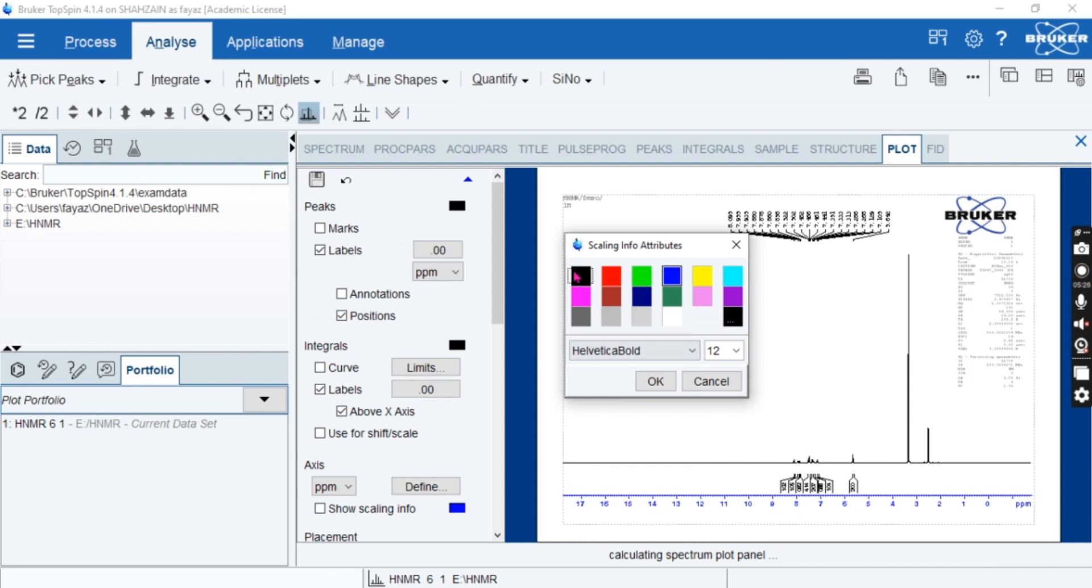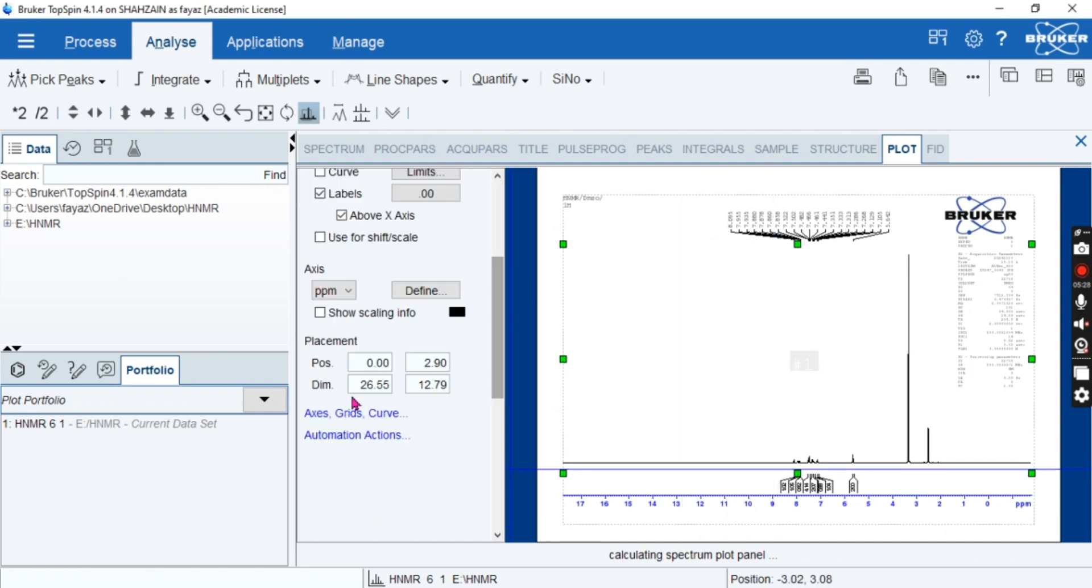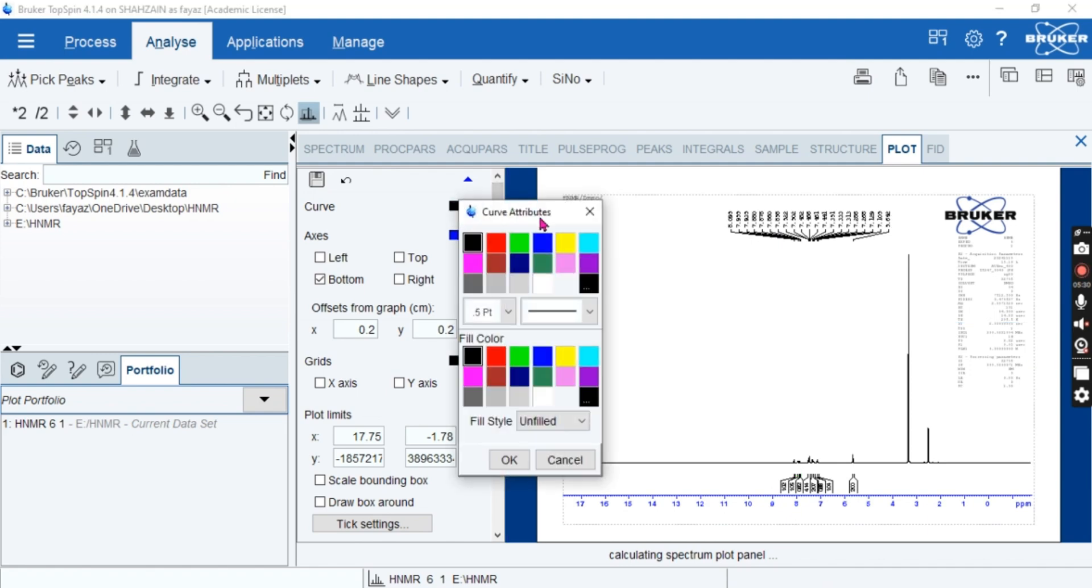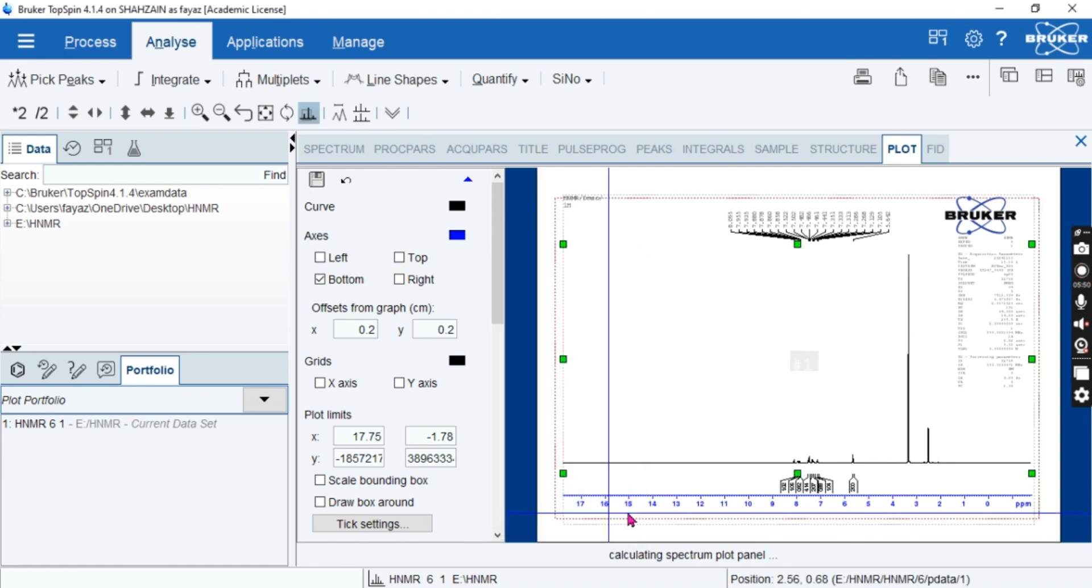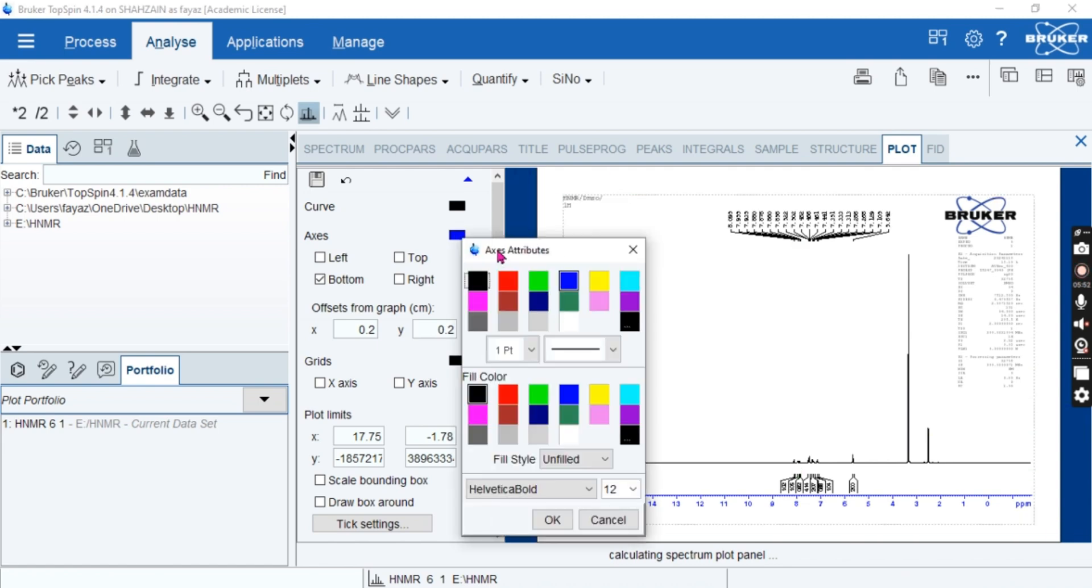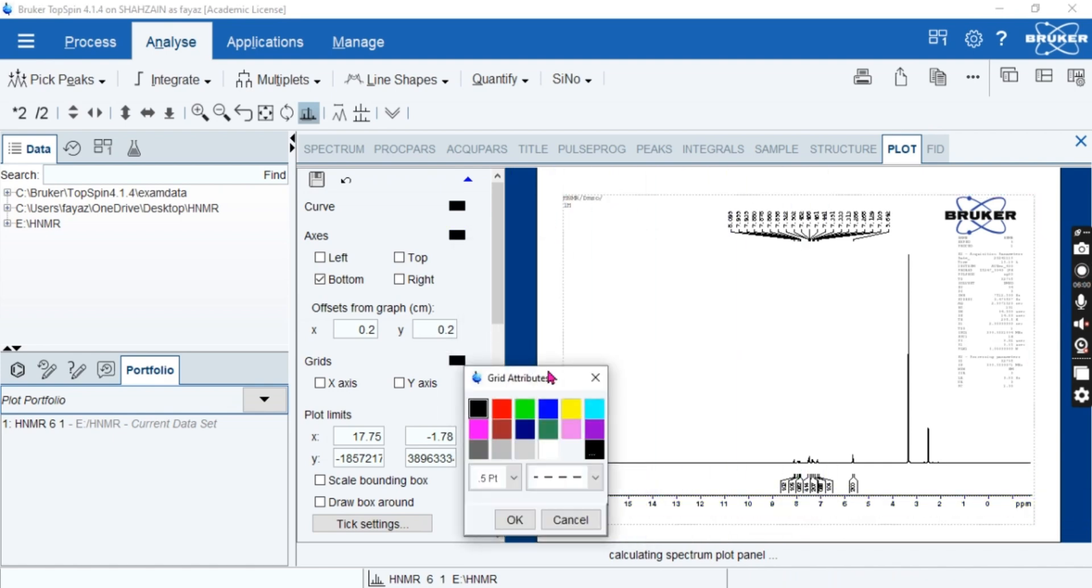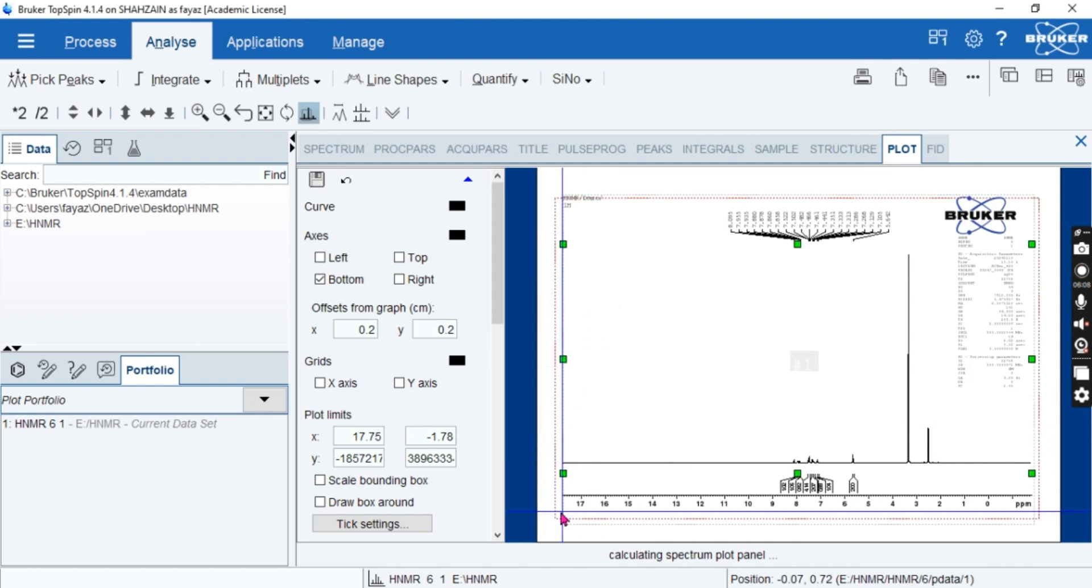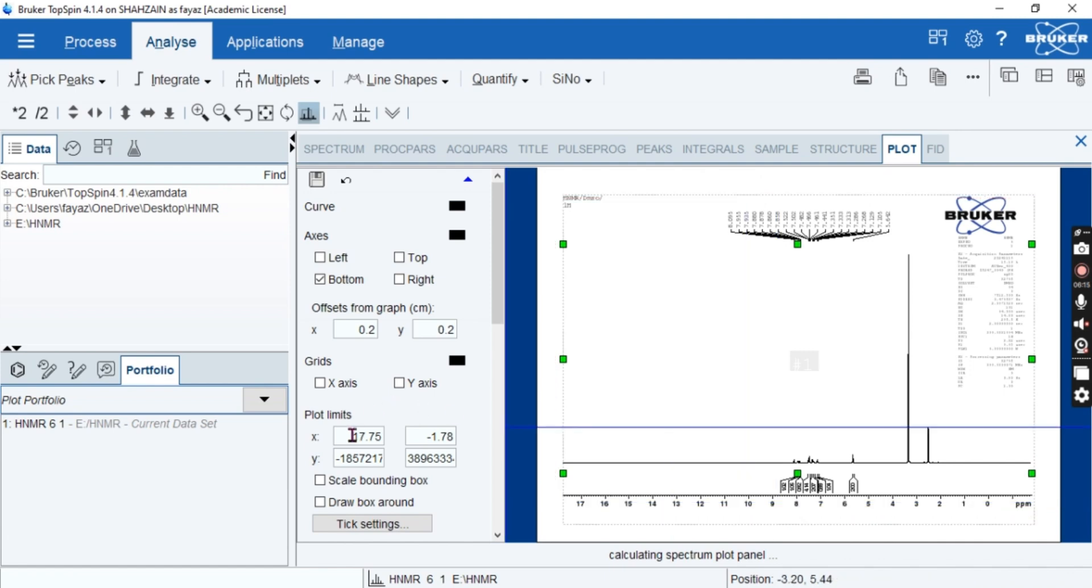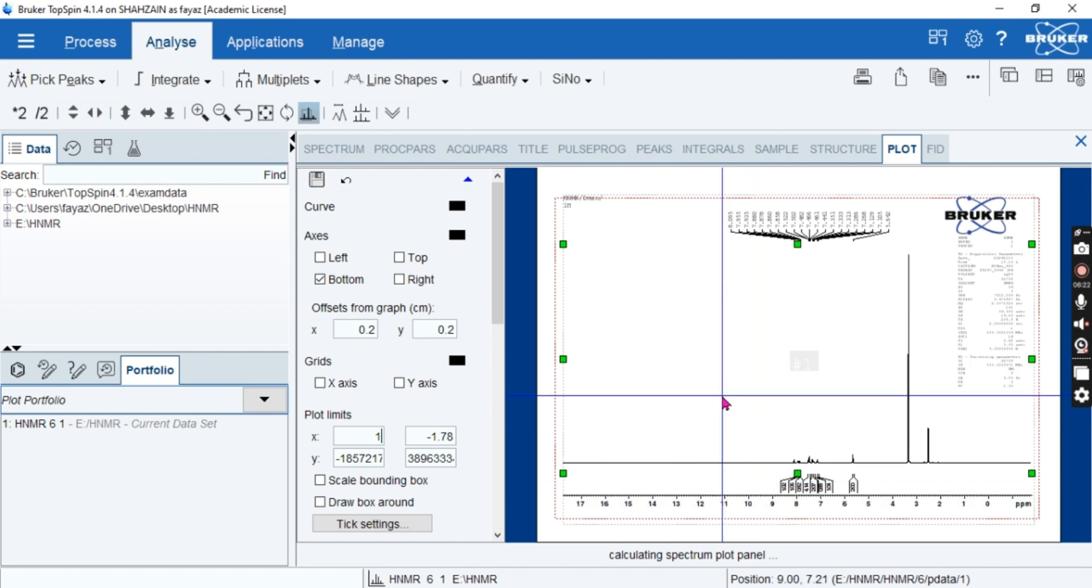So let's do the axis. We have curve axis attribute, so curve should be one when you print this document and that will be shown in a better way. Color black and this is black color, okay. And this is the axis attribute, and axis attribute color should be black, so this is axis attribute color the black. We have grid attribute and in grid attribute this should be one, so it's one now. This region can be verified, and if you need 17 or more than 17, but actually we can see here that we should just need till 10.